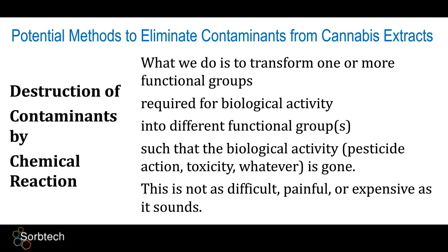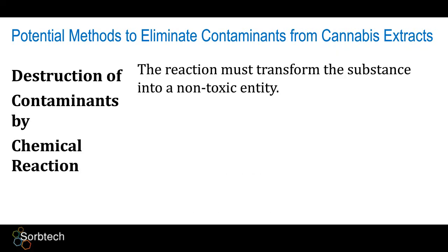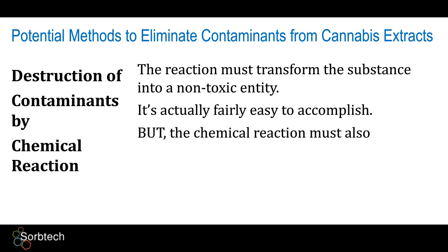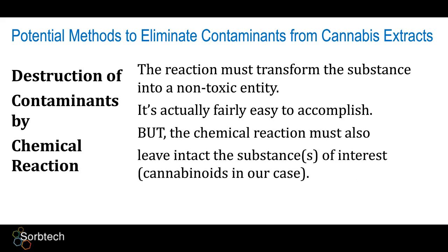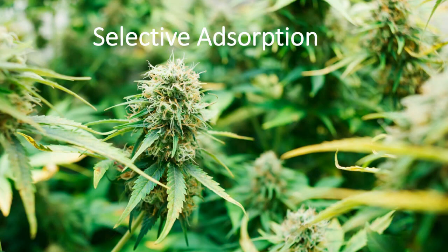This is not as difficult, painful, or expensive as it sounds. The reaction must transform the substance into a non-toxic entity, and it's actually fairly easy to accomplish, but there's a definite requirement. The chemical reaction must also leave intact the substances of interest, cannabinoids in our case, and this can be done. We did it and are doing it. So we'll go over some of these in more detail right now.